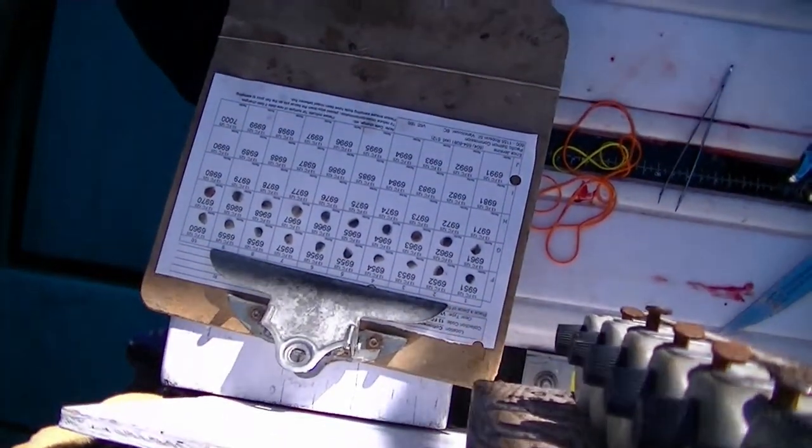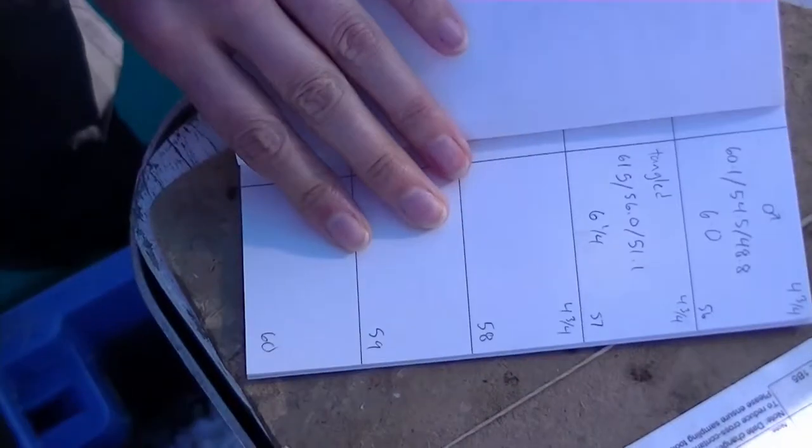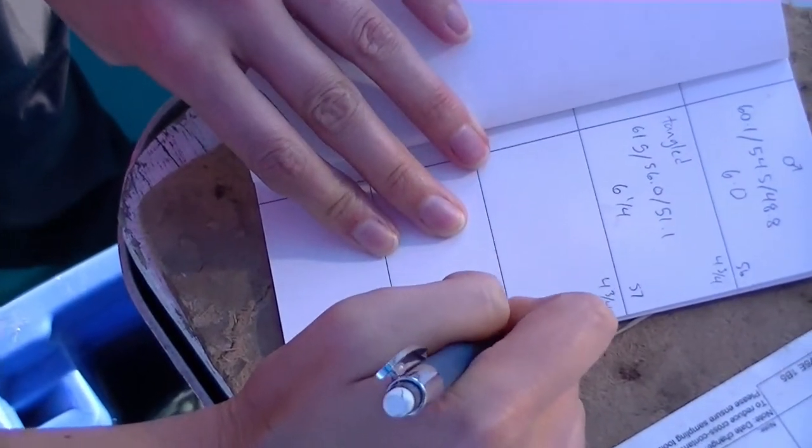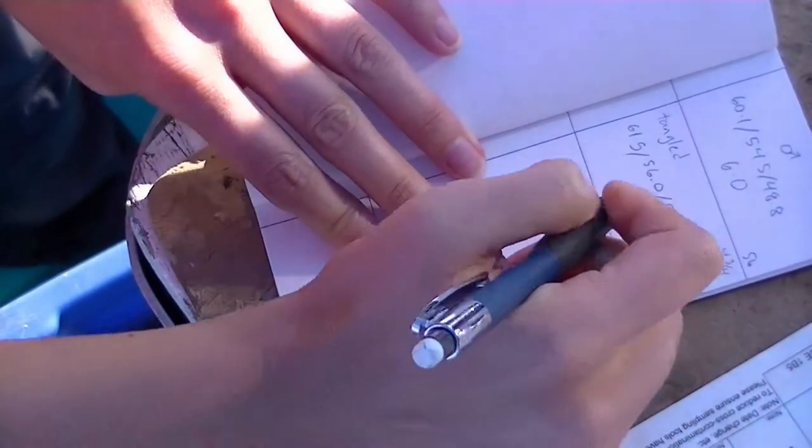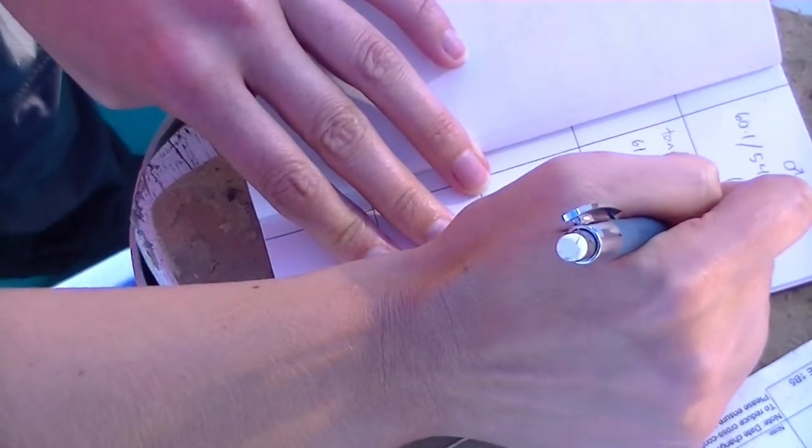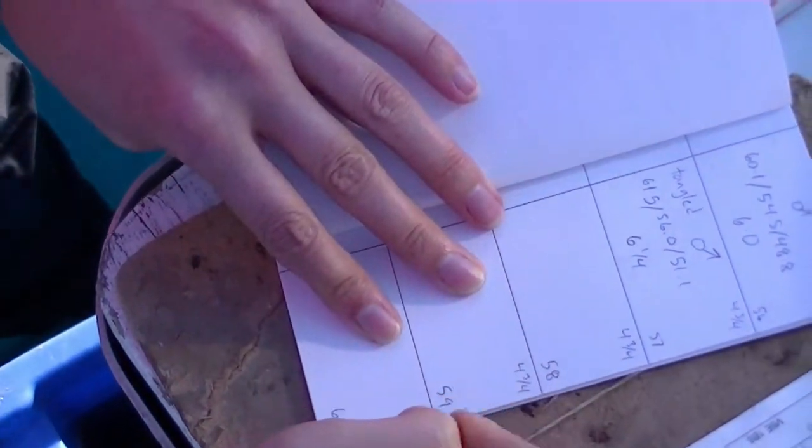The entire sampling process took less than a minute for this fish, though it may take longer without a helper to record information. The recorder has written down the length, sex, and weight, and the scale is placed in a pocket in a scale book next to the recorded data.